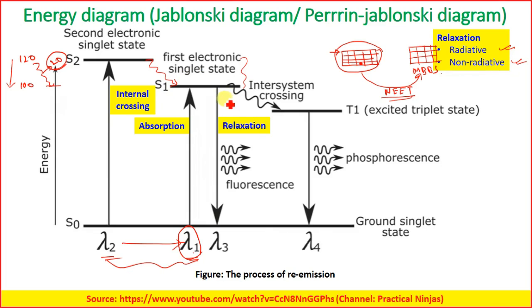It is losing energy, unlike over here, where while losing energy it is also releasing some energy. But in this case, it is not the case. It is non-radiative, and when it is coming from a higher level to a lower level, it is losing some energy, and correspondingly the wavelength is increasing.